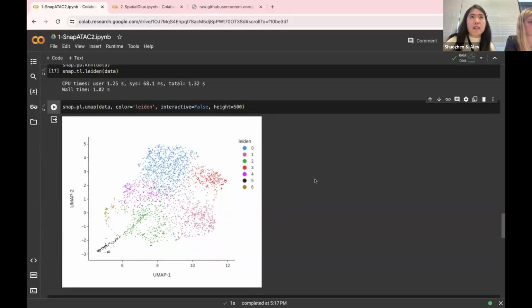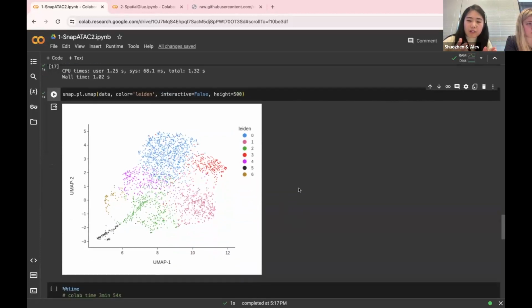So for the ATAC experiments, we are getting the DNA fragments around the open region. If it's openly accessible, then the enzyme will cut those regions, and we will collect those region information. While we are mapping it back using the genome reference, after aligning it, we actually have a certain range of the genome with a lot of peaks, a lot of fragments. And those fragments gathering together have a certain profile throughout the genome.